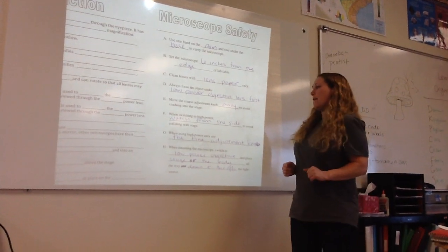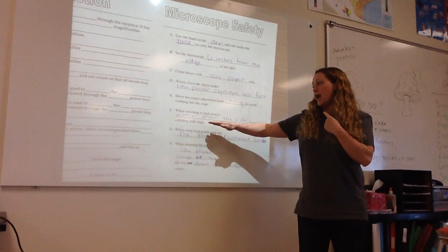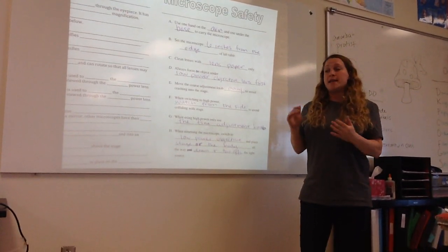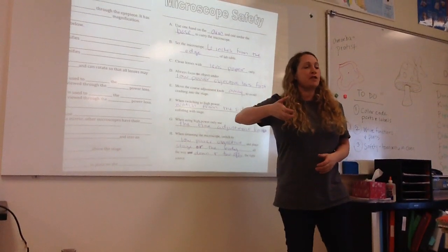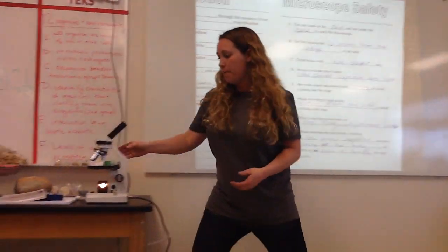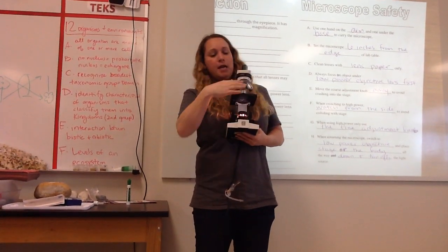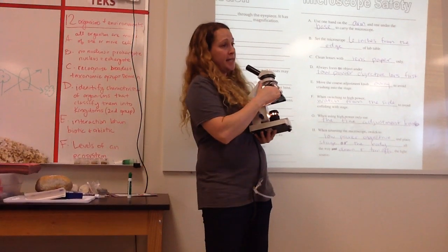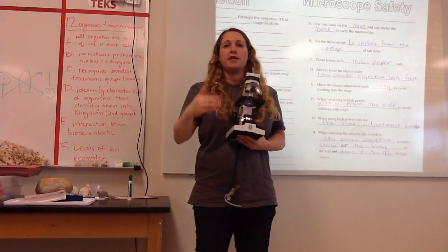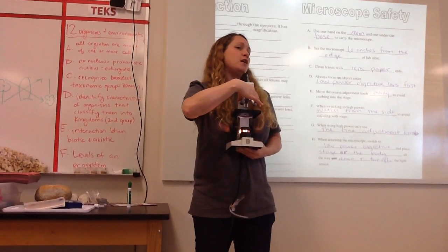Okay, so we're gonna switch to high power. You're gonna take your eye off, and you're gonna watch from the side, because the next objective lens is longer. So when I'm switching, there's a risk that it'll hit. I'm going to show you what I'm talking about. Holding it up. Nose piece is this piece. And you're going to switch it to the longer one. We have three choices here. I'm going to the 10 times power. I'm not going all the way to 40 yet. Okay? So, again, I'm going to listen really close. Make sure it clicks into place.